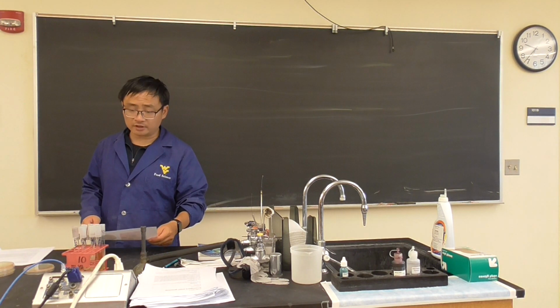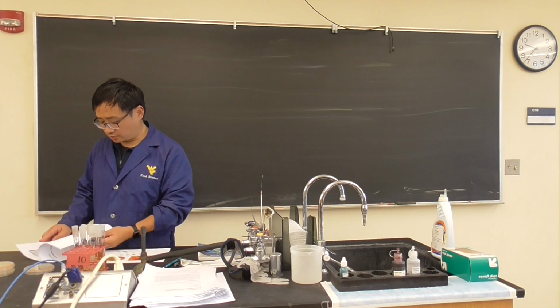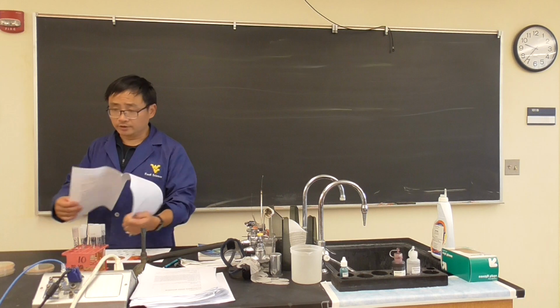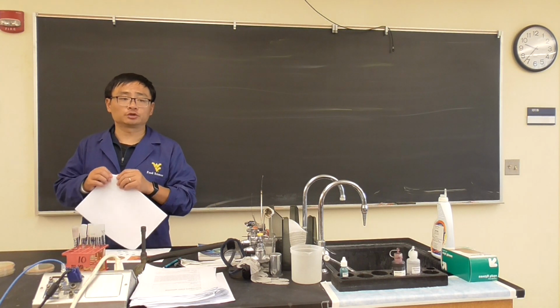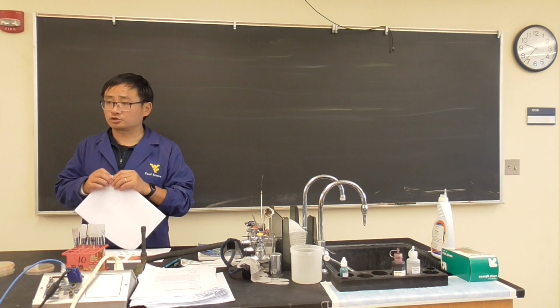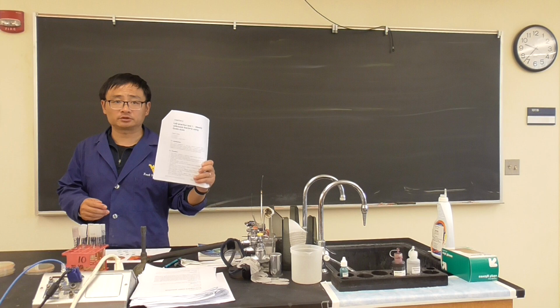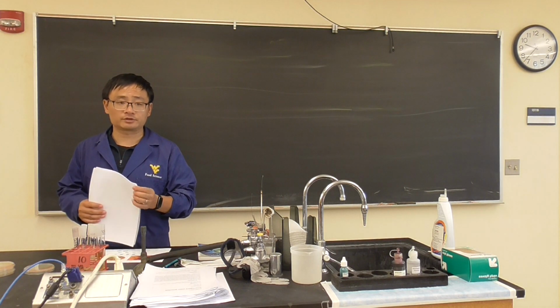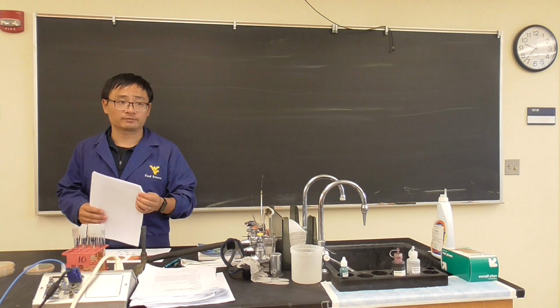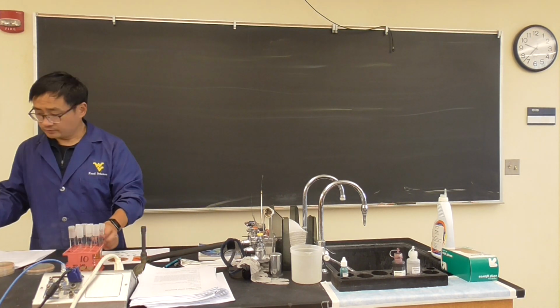Okay, now let's have a class. So we're going to go over the results, and today's major work is that two of you will work together to do the Gram stain of 2 colonies from your streak plating plates and finish the lab report of the Unknown-1. But the result is clear, which is E. coli and Serratia. And so we want to talk about something first.